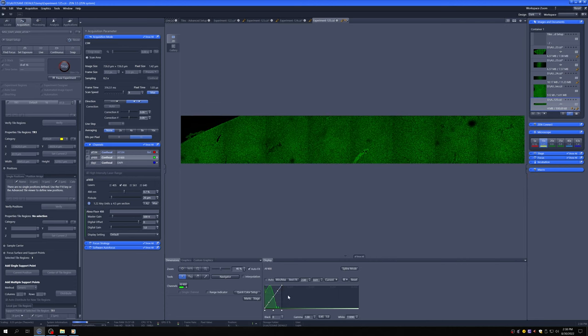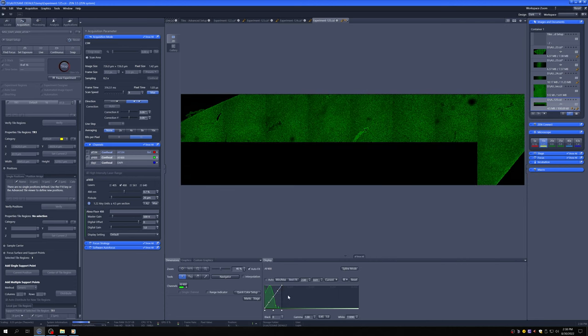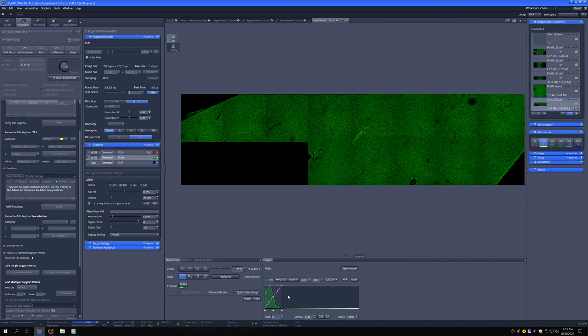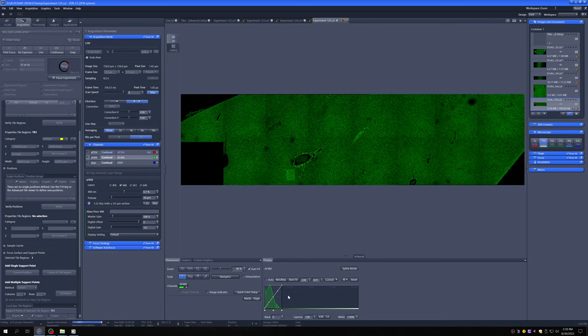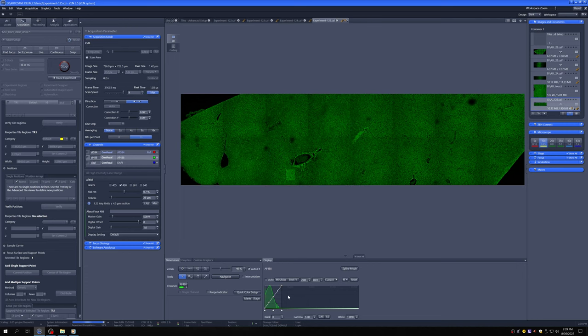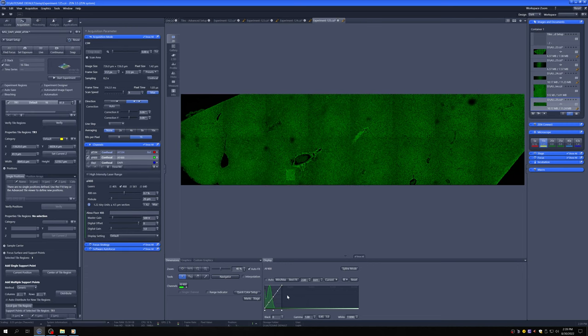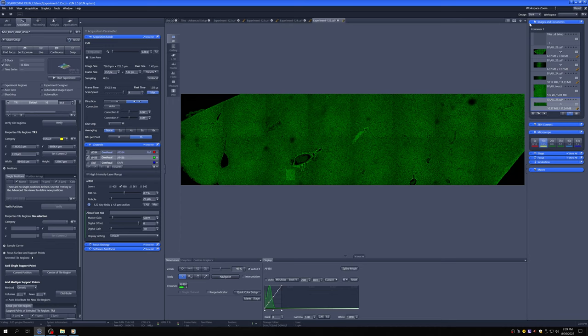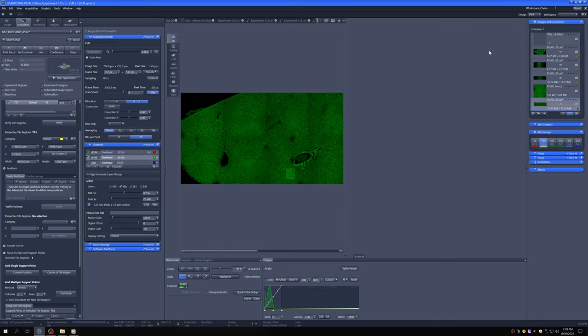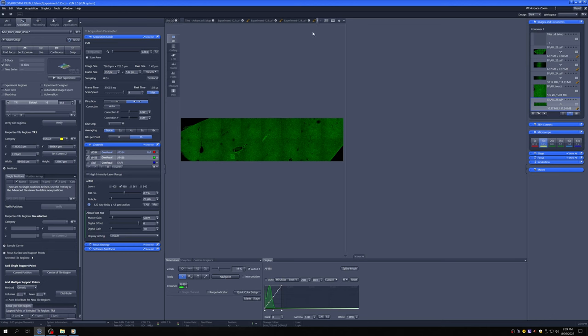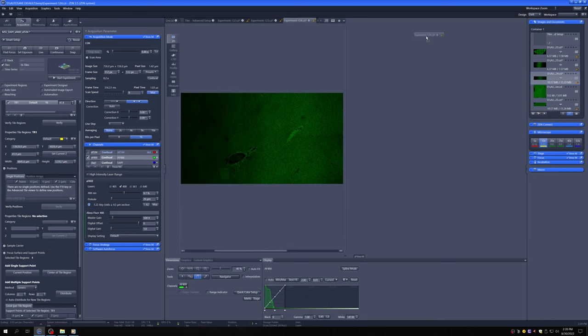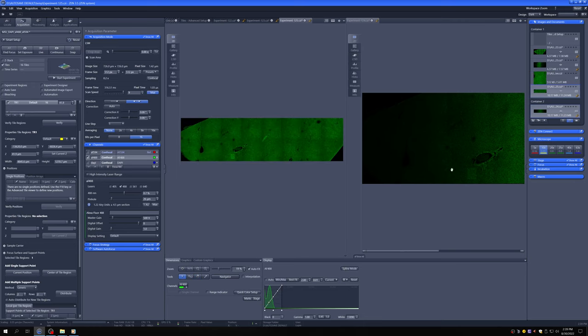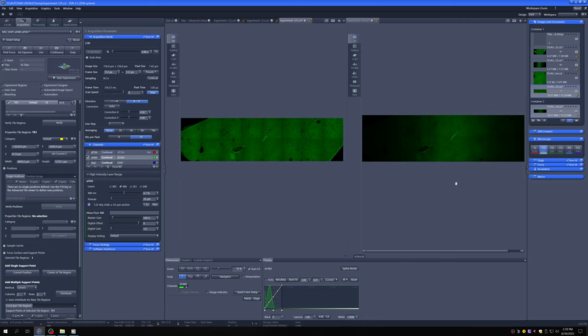The assumption that this was a tilted plane is correct. By tilting at the appropriate amount, we get a very nice, evenly in focus sample and you can compare them. If I just go here to the gear to two containers, if I move this one over and compare it to this one, you can see this is without that adjustment and this is with the adjustment. So it really works quite well.